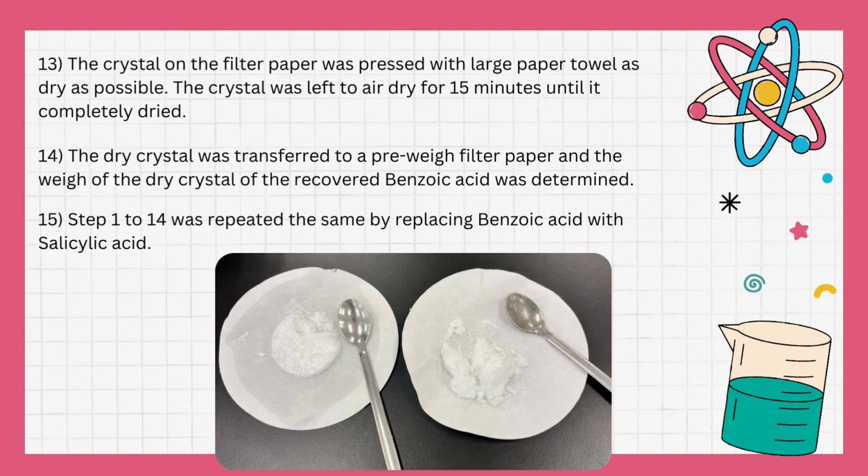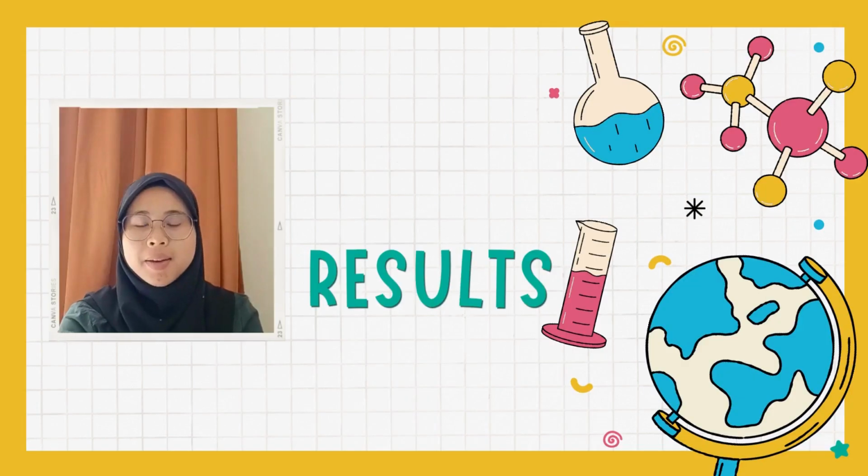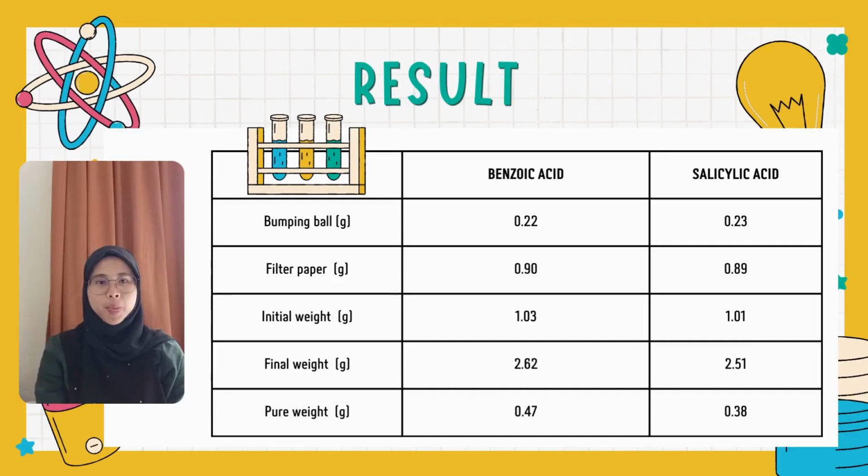This image shows the final result of recrystallization of benzoic acid and salicylic acid. My name is Nurul Fatih binti Hishamuddin and I will continue the presentation with the result. This is the result of the experiment that my group has conducted.